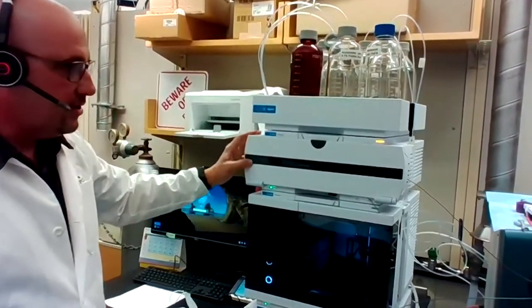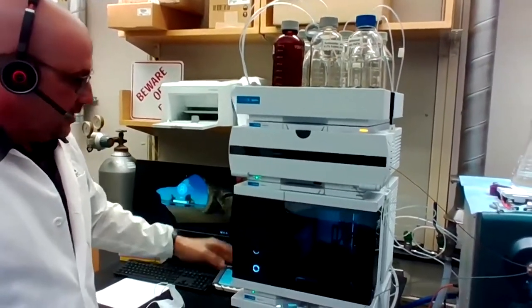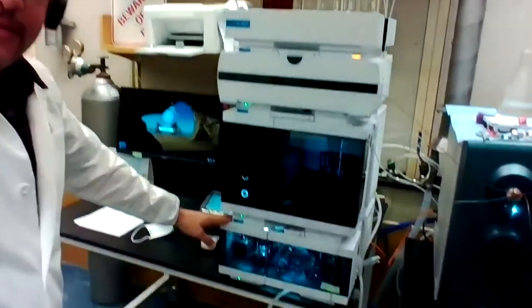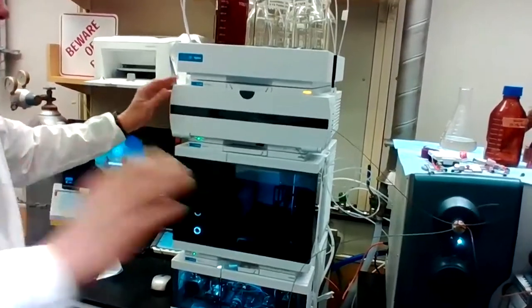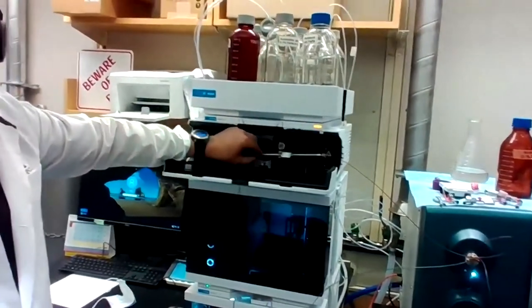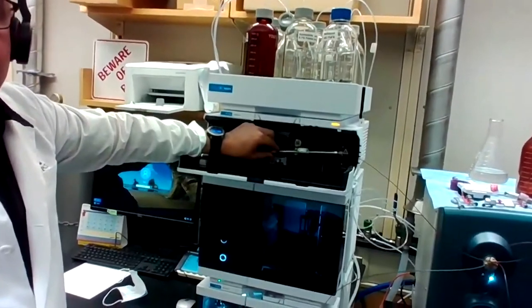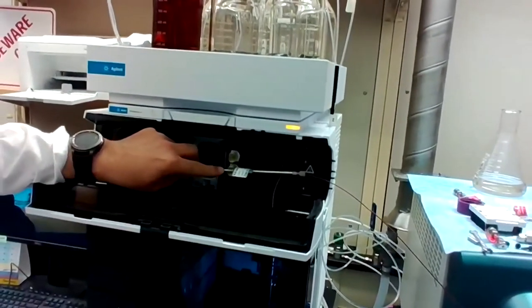The HPLC consists of three parts: a pump which is located on the bottom, an auto sampler which injects samples, and lastly a column compartment that has a column inside, which is used to have some retention and also separate compounds.